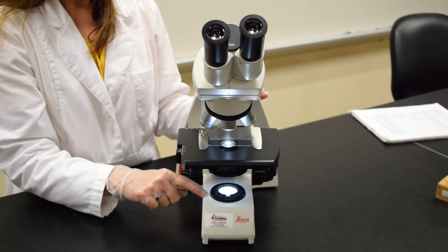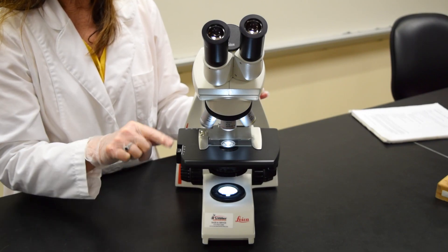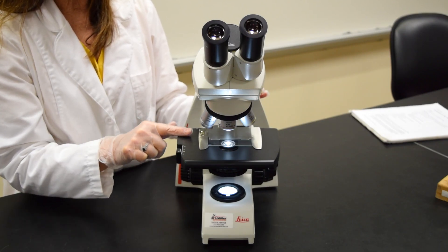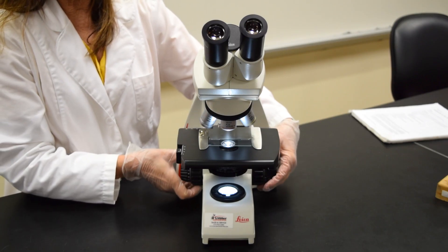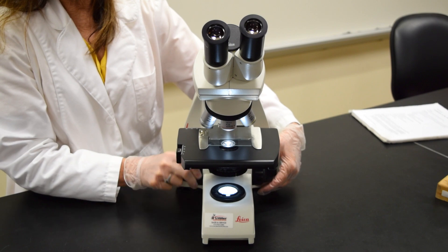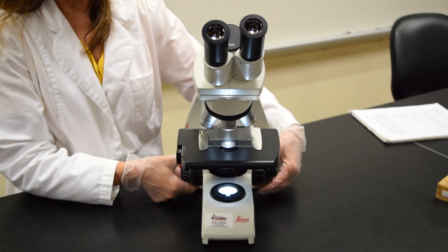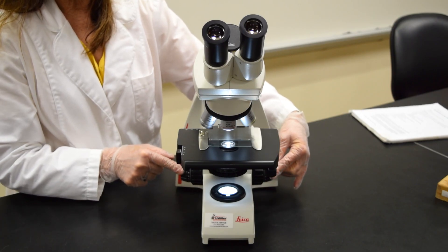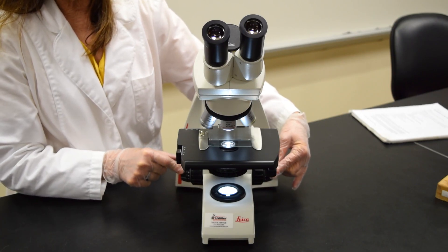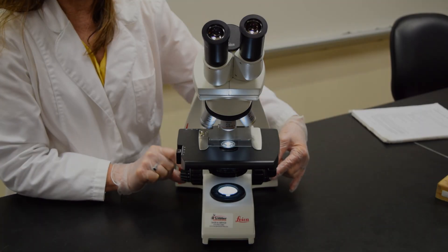On the base, you'll find the light or the illuminator. To move the stage closer to the objectives on the arm, you're going to find two knobs. The coarse adjustment knob that moves the stage in large increments and should only be used for the scanning power. Connected to the coarse adjustment knob would be the fine adjustment knob that moves the stage in finer increments.